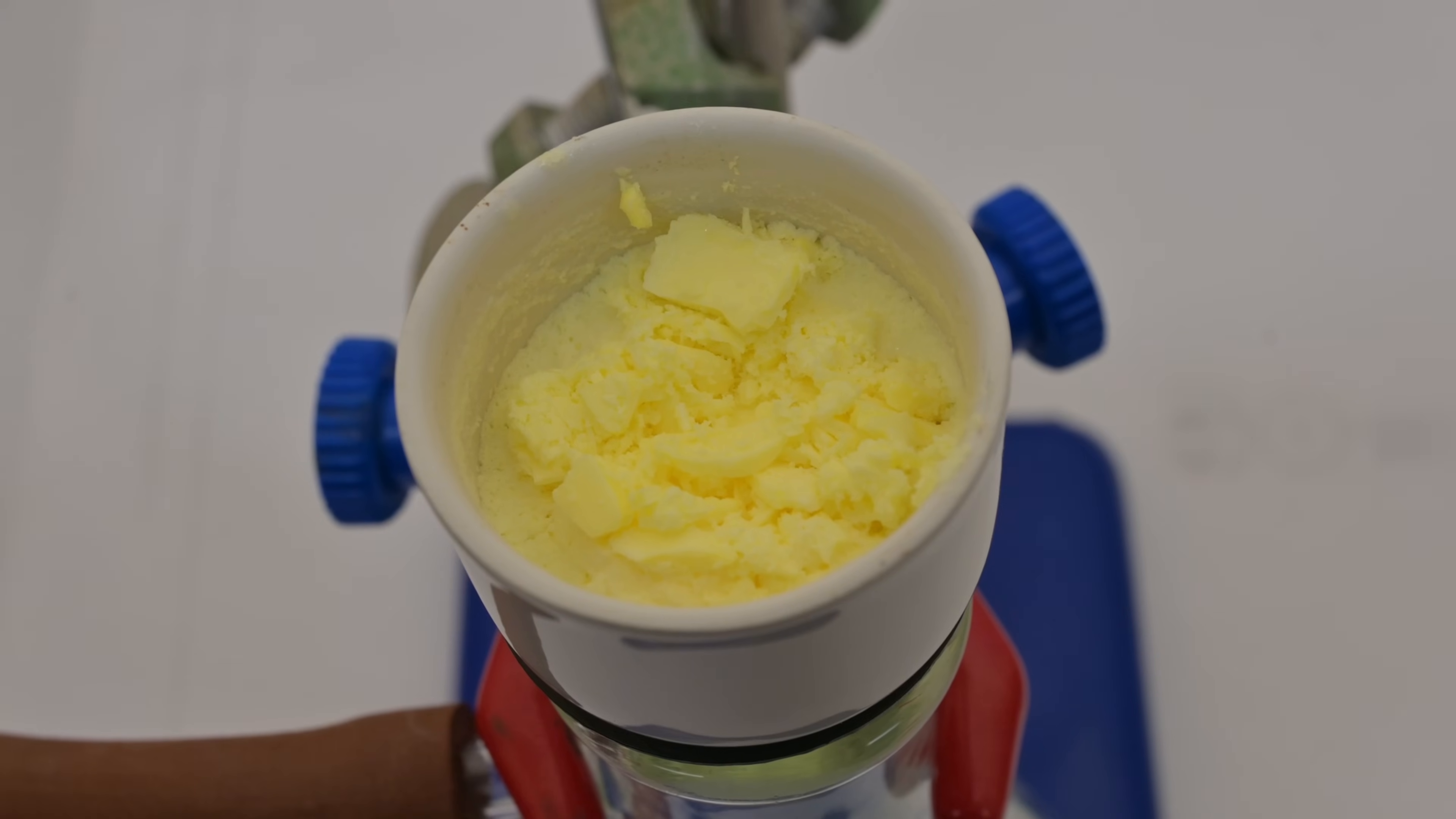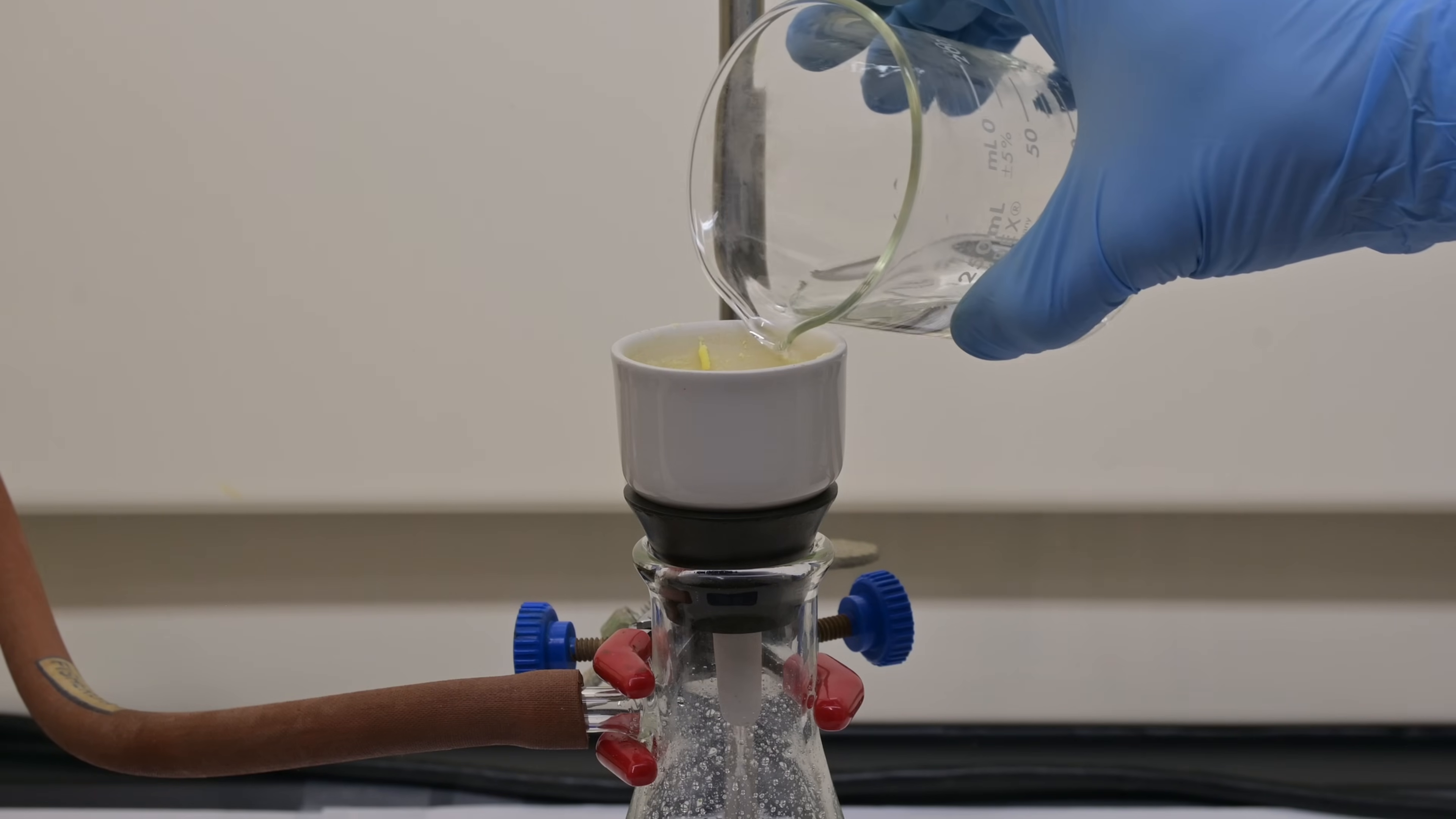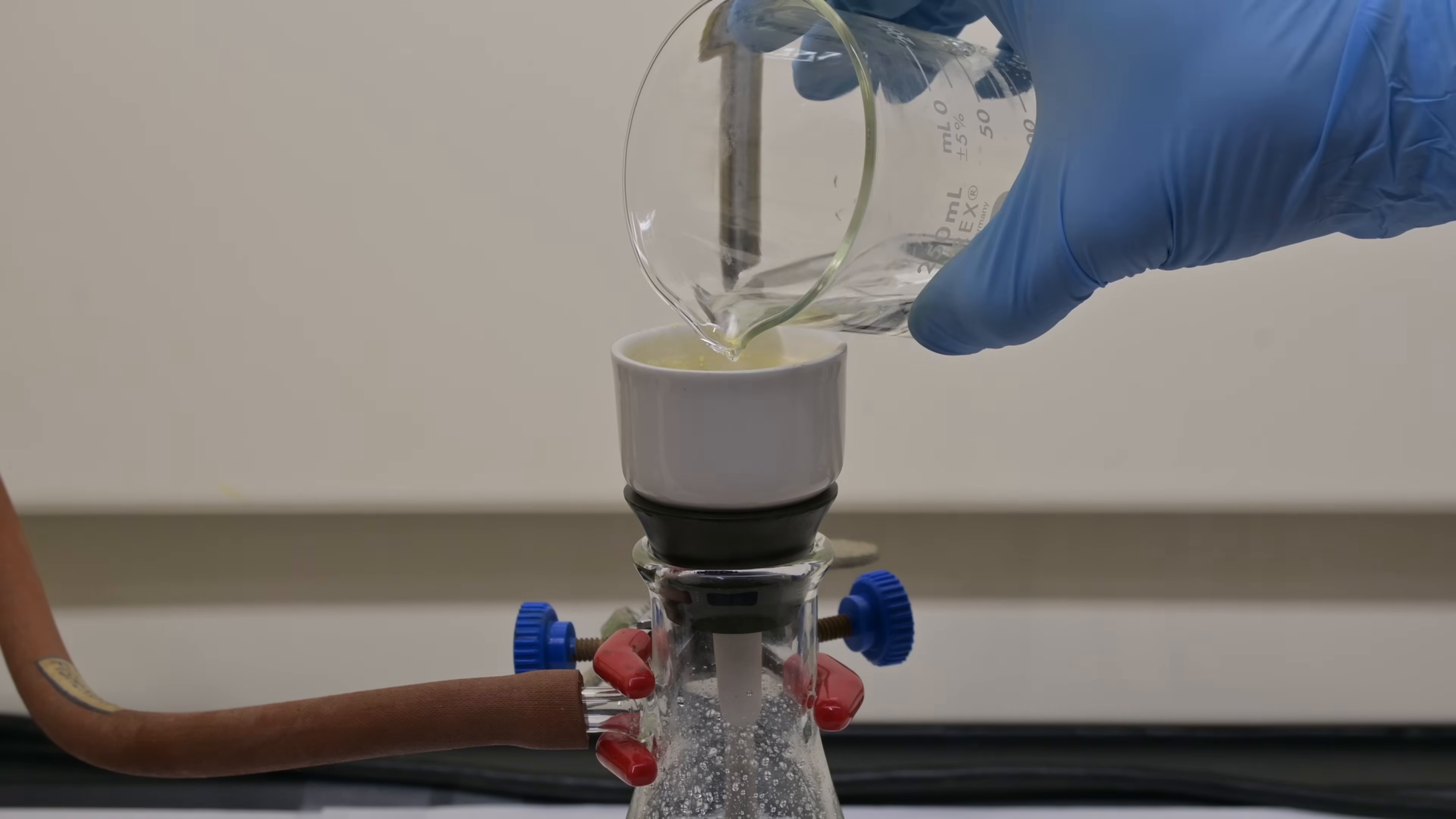Next, we need to collect our product. To do this, we set up a suction filtration apparatus and filter the yellow benzil crystals, washing thoroughly with methanol or alternatively 75% aqueous ethanol. This step helps remove any impurities that might have adhered to the crystal surfaces.